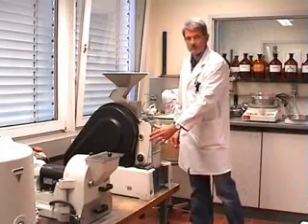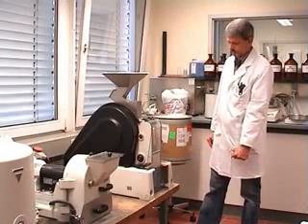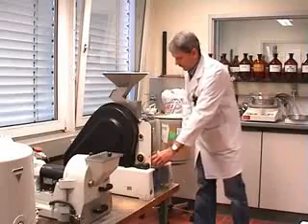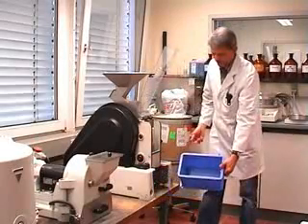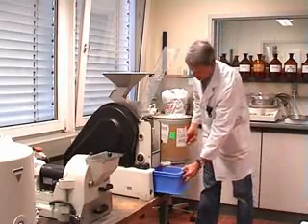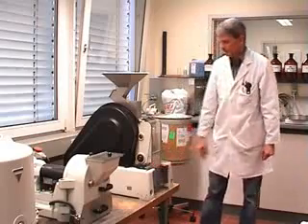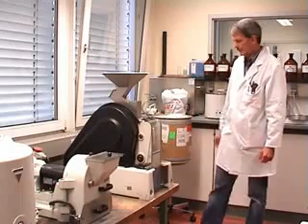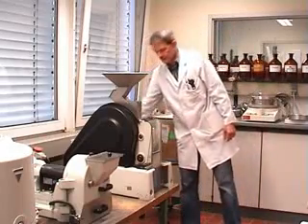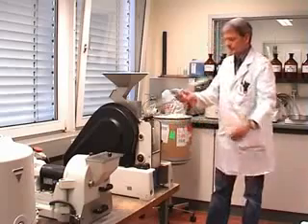After the sample passes the instrument it is collected in a vessel that is underneath the instrument. My colleague now opens the instrument and shows you where the sample is collected. The cover contains also a safety switch — when you open that cover it will automatically stop the machine for safety protection.